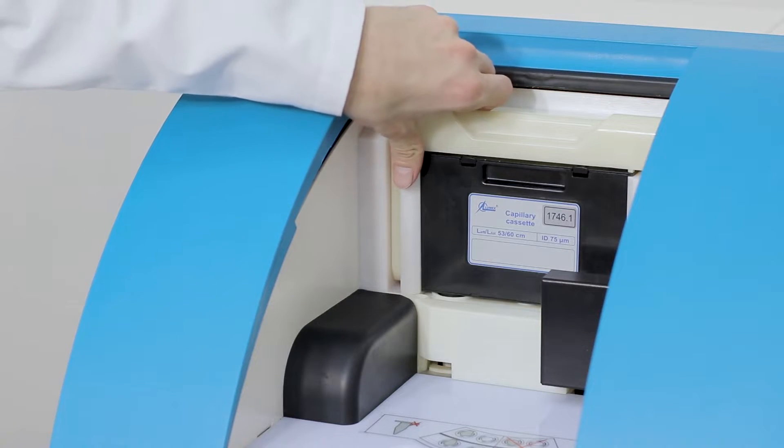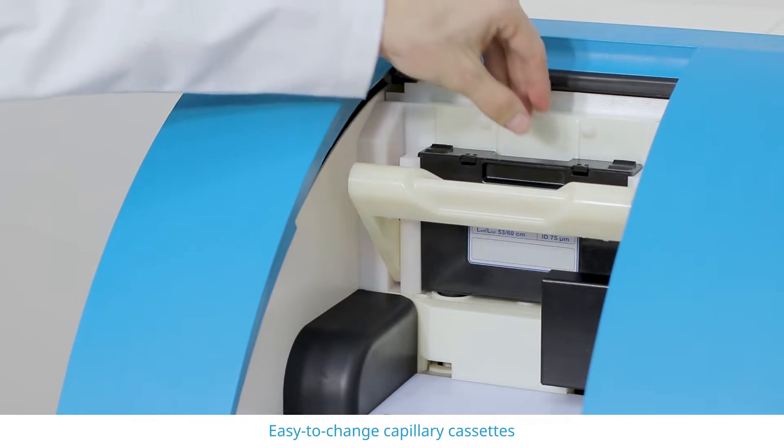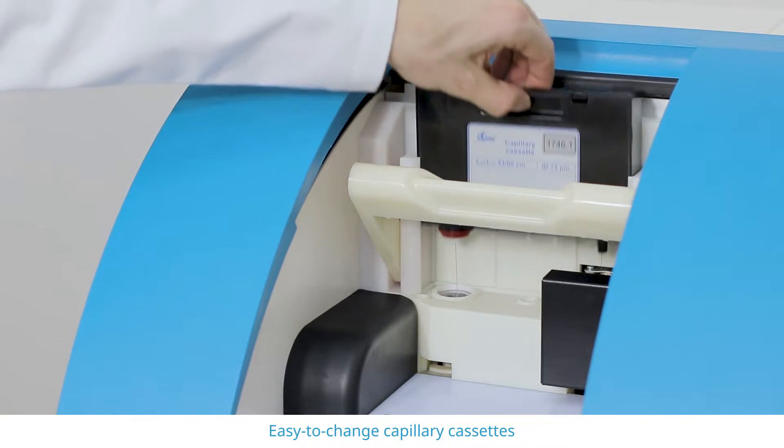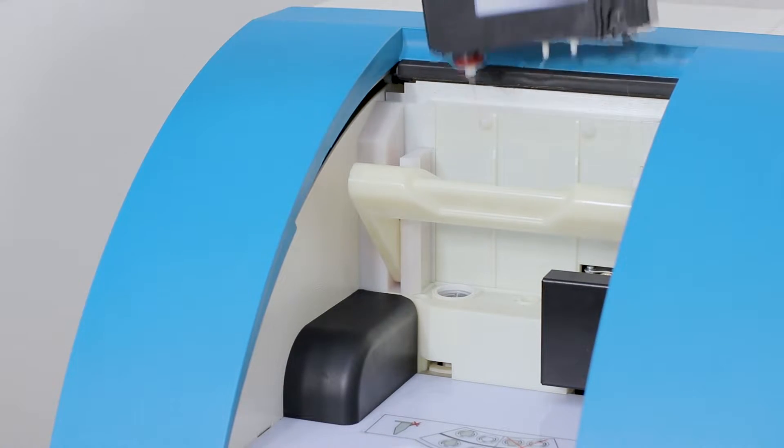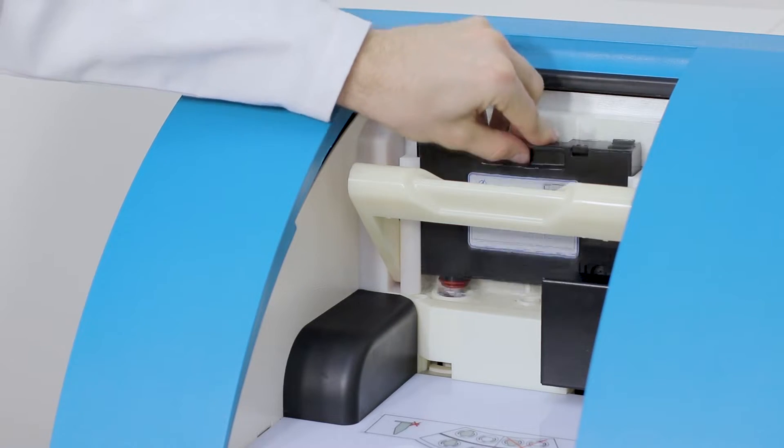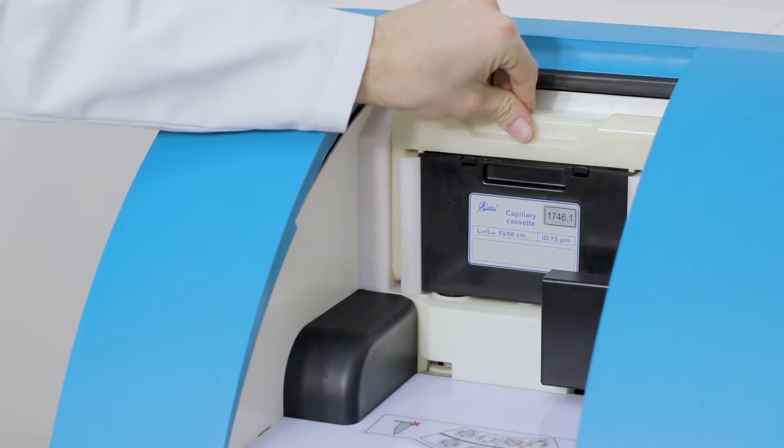Unlike expensive HPLC columns, capillary cassettes with automatic capillary rinse are affordable and easy to use. They allow you to run many different analyses without changing.